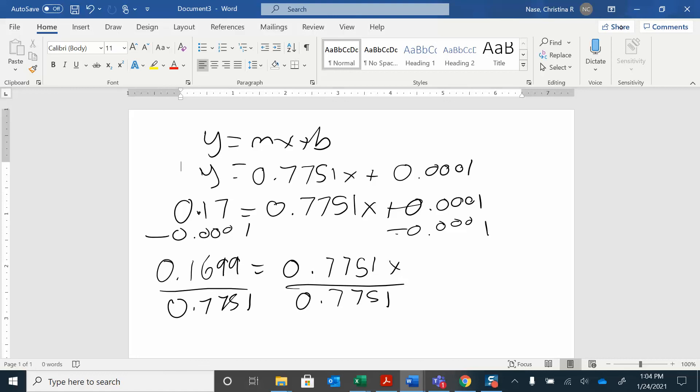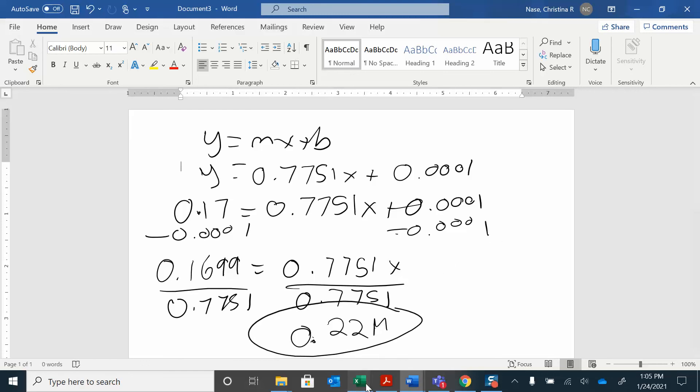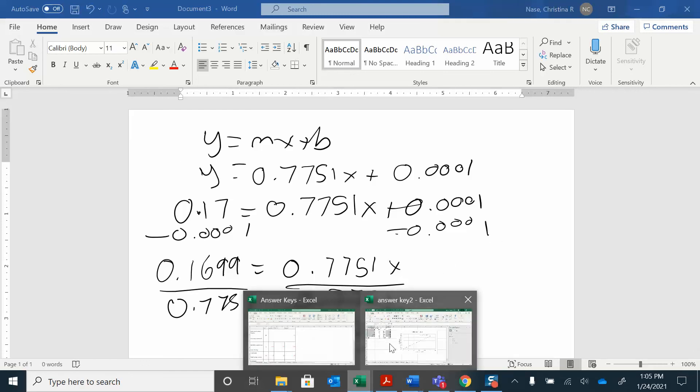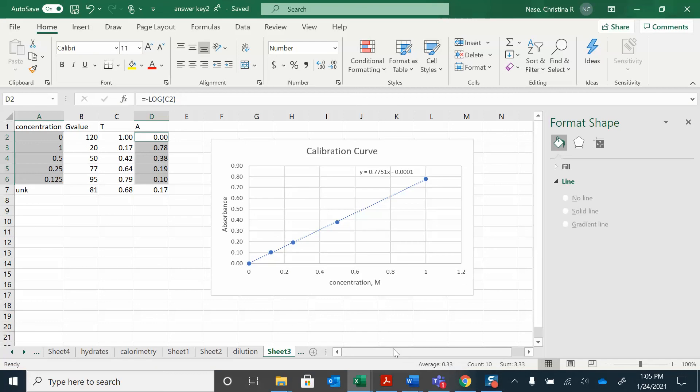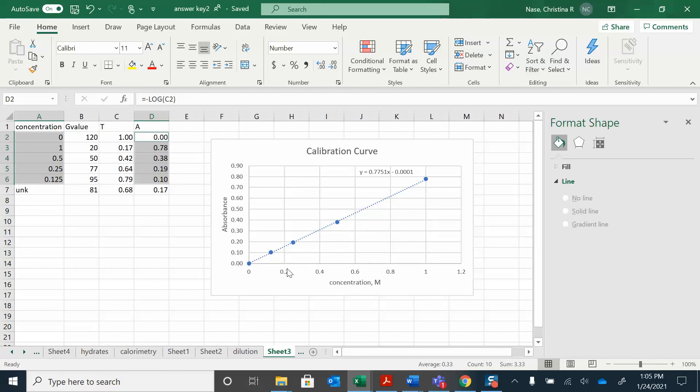And I got 0.22. 0.22 molar. And we'll see if that feels right. So my absorbance was like 0.17. And so that would... If I found the absorbance, it would be over here. And if I drop that down... Yeah, sure. About 0.22 molar. That makes sense.